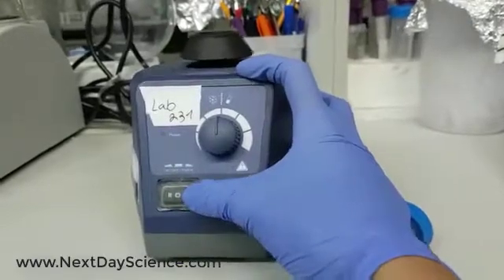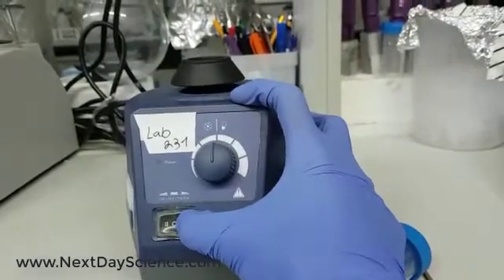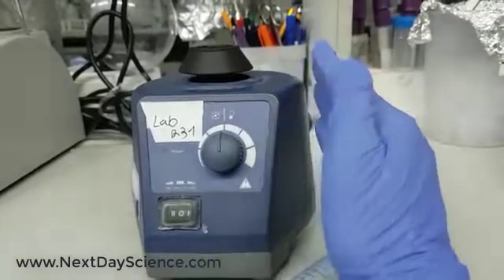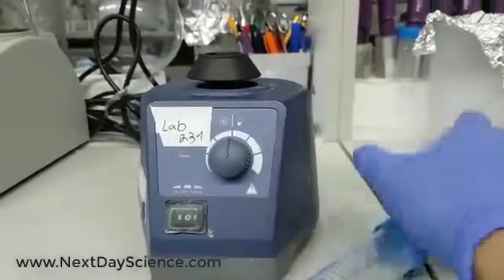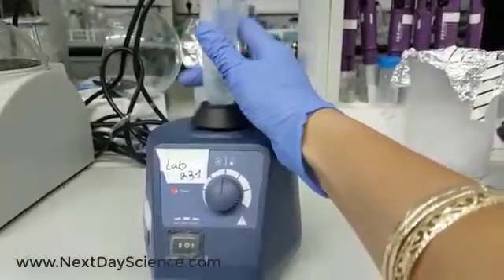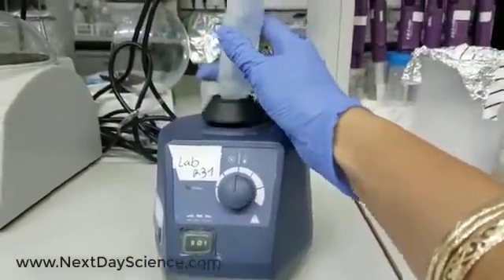The third option is touch mode. One click to activate it. Touch mode means that the Vortex will work only when I press it. Take the tube, press it in the middle, and your sample is vortexing.